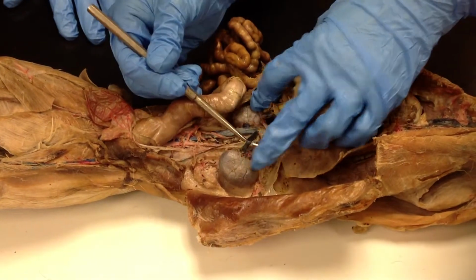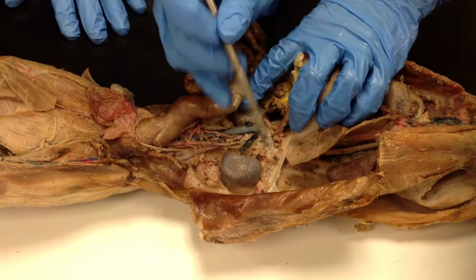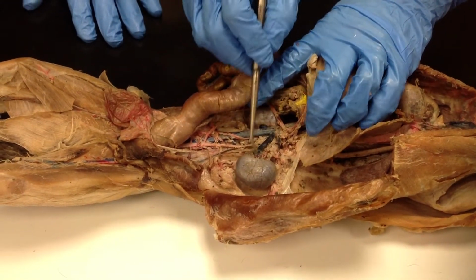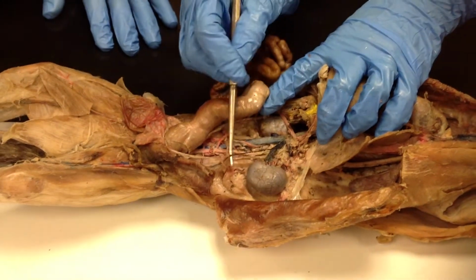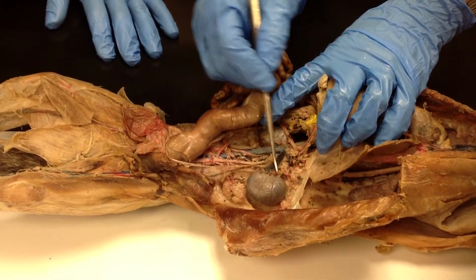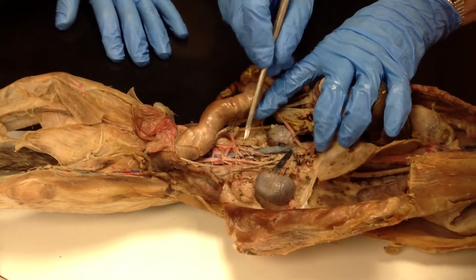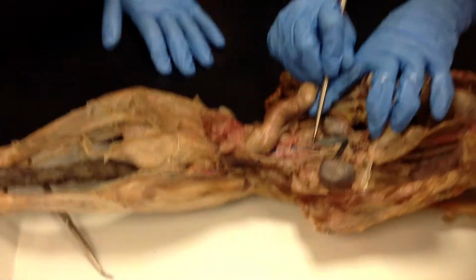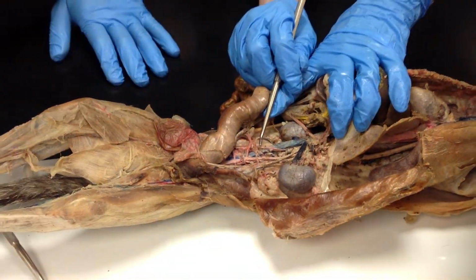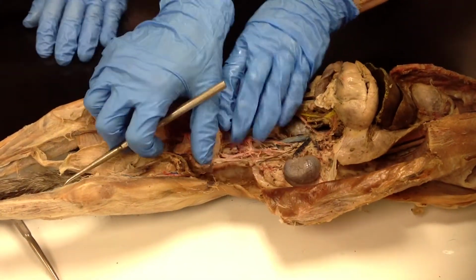These are the renal veins, going through the kidneys. Okay. This right here, this is a kidney. So this is a renal vein coming from the kidney. And this little piece of thread right here, this is actually a gonadal vein coming up from the gonads. And then this is the gonadal vein on the other side. It comes right off the vena cava. So what's this right here? Okay. Coming down here.